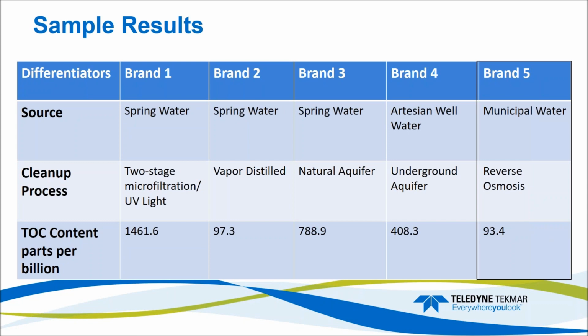So, you could extrapolate from this. It's not really a large enough sample study, but you could say perhaps that bottled water is typically cleaner than tap water, so you are getting a little more bang for your buck. You're not just paying for the bottle, you might actually be paying for cleaner water to drink. Again, though, more testing would be needed. I would like to do several different lots and all that kind of stuff, but that would take months and months. So this is just to show you a little sample of what kind of testing you can do with the Fusion.